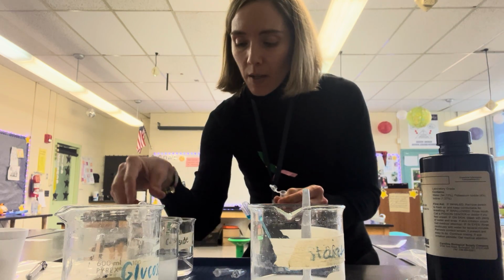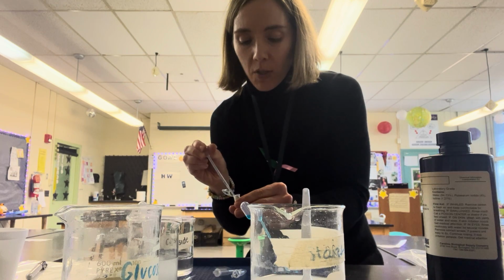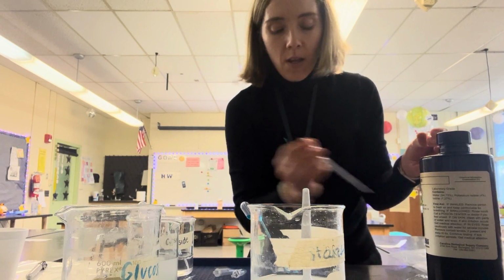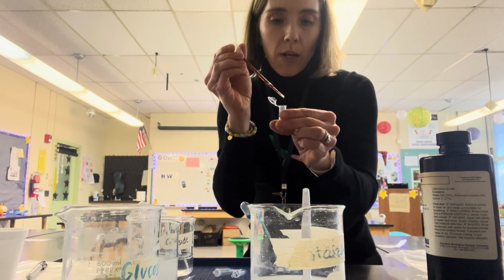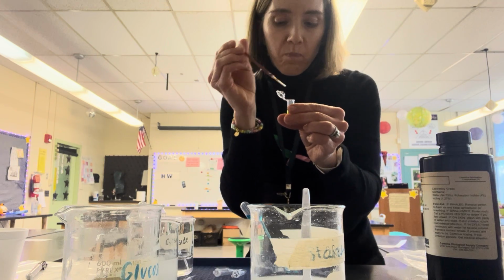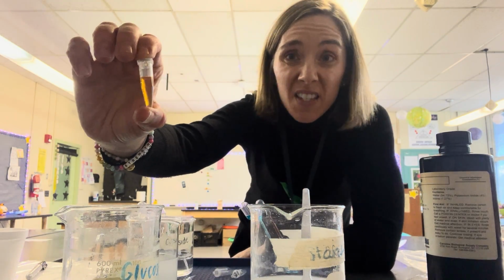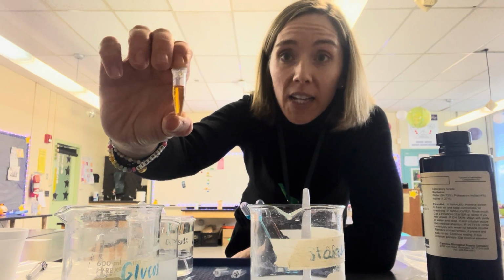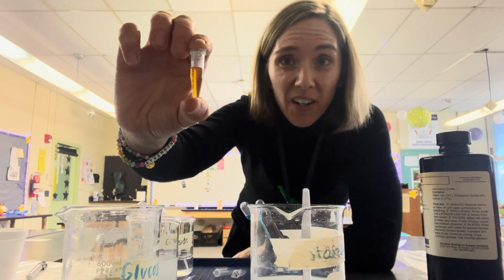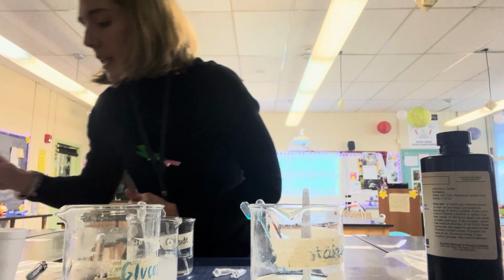Outside iodine. So we're taking my outside liquid. This is looking for starch because I'm using iodine, and I'm going to put a few drops of iodine indicator into it and see what happens. Doesn't seem like it changed color. So my outside iodine stayed kind of this orangish color, showing that there is no starch outside of the tube. Let's see if anything happened.